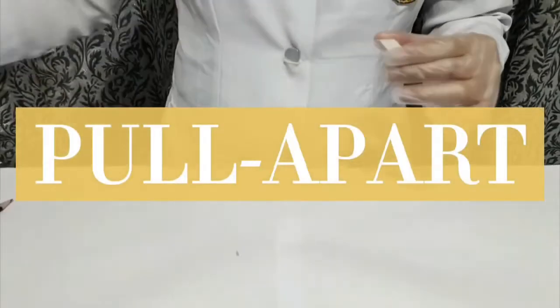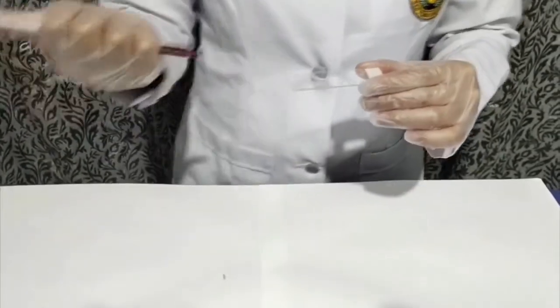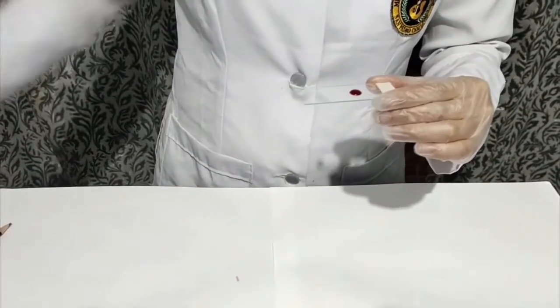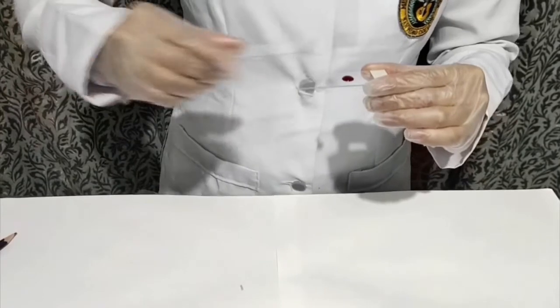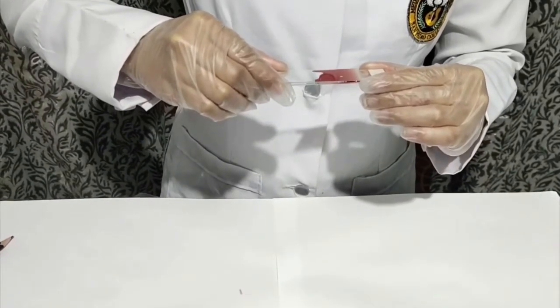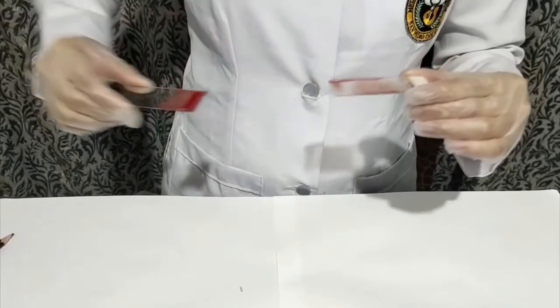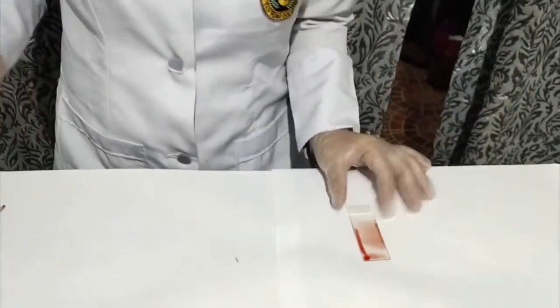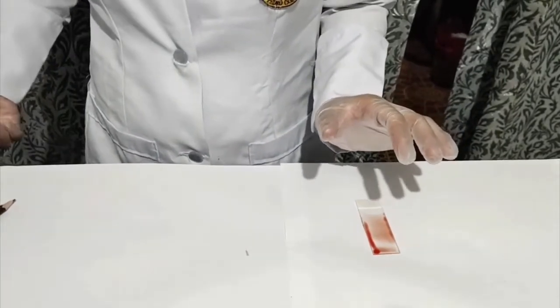Next method is pull apart. Place a drop of sediments at one end of the glass slide. And then, cover it with the end of another glass slide. Allow the sediments to spread evenly between the attached surfaces of the two slides. With a single uninterrupted motion, pull the two slides apart in opposite directions. And then, cover the smear with a cover slip.